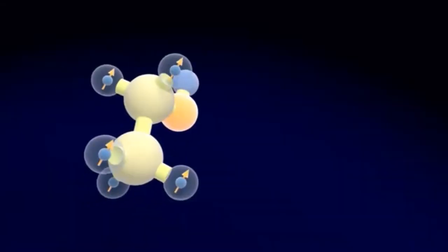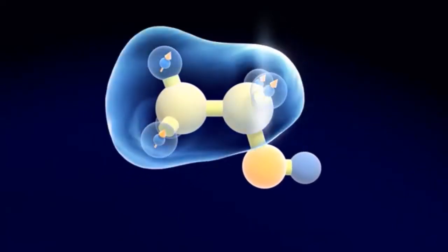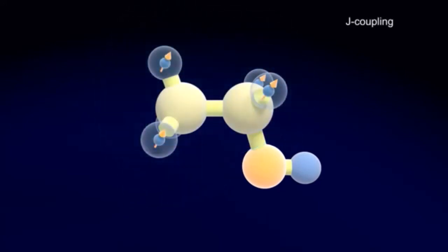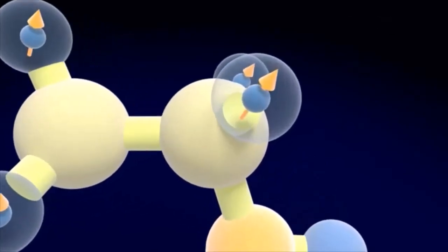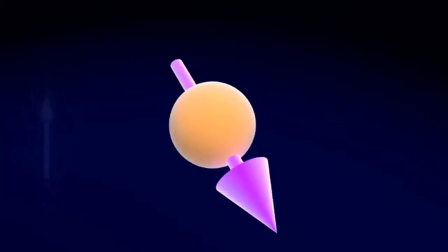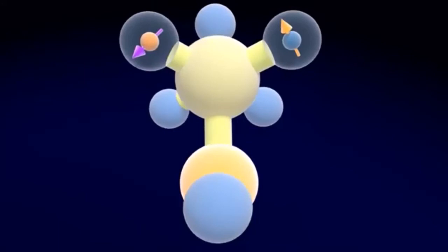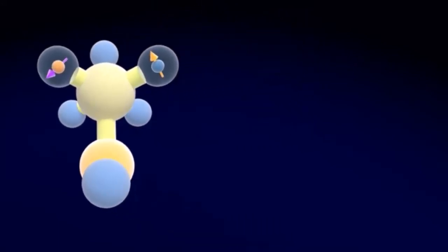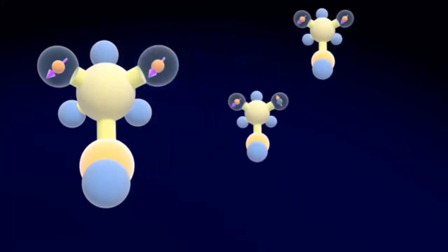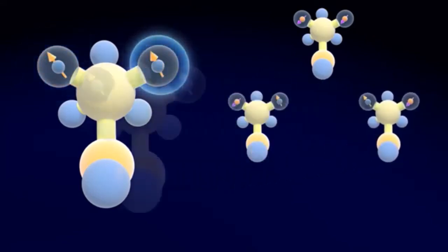Since nuclear spins behave like magnets, they also influence their neighbors. One way this happens is through shared electrons in the chemical bonds in the molecule. We call this J-coupling. Each spin can have two states, along the magnetic field or against the magnetic field. As an example, we look at the two methylene hydrogen spins, which are chemically identical. They can have four combinations: one spin down, one up, both spins down, one up, one down, two spins up.